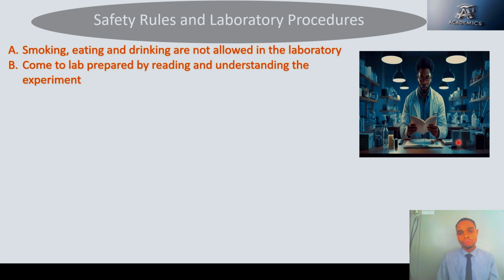Always come to the laboratory prepared. Make sure you understand the experiment you want to do before you conduct it. Make sure you know the hazards and plan for safety in advance. You understand? So be prepared. Understand the experiment you want to carry out before you do it.